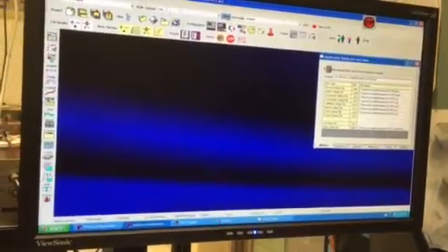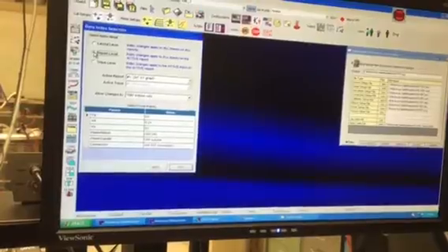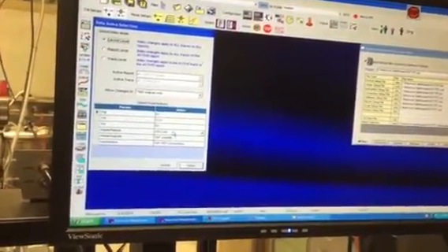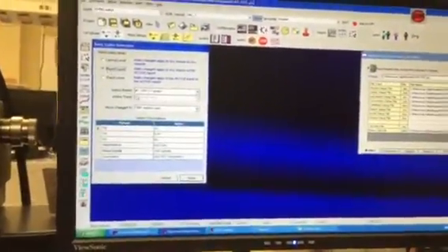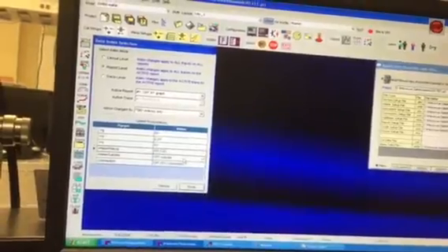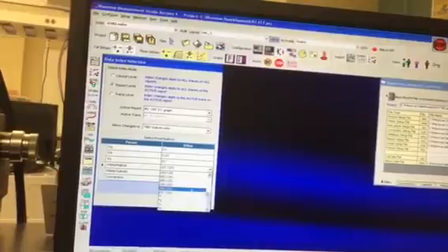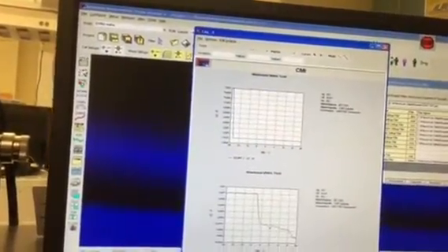So when I came in here, when I went to view the layout, instead of saying layout level, I said report level. So layout level basically says whatever parameter you pick here, it's going to apply it to every report in the layout. But if I do report level, I can individually control that this report I want it to be at that one, and this report I want it to be at that one. And so now when I view it, you can see I get two very different ones.